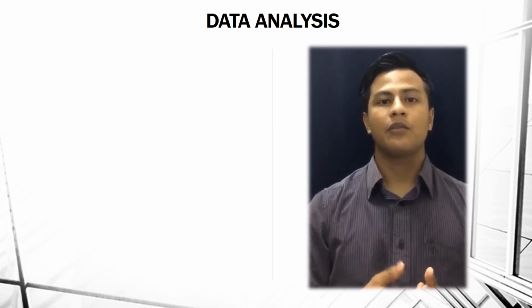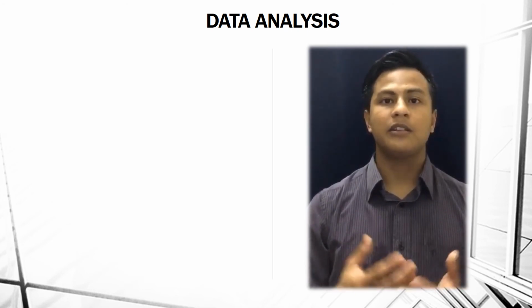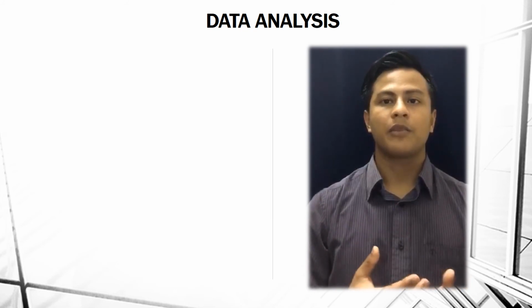Another advantage when we are using HTGC is that we can study the origin, and some sources of crude oil can be analyzed. All models of experimental data relate to the distribution of N-paraffin, which is now available from HTGC.